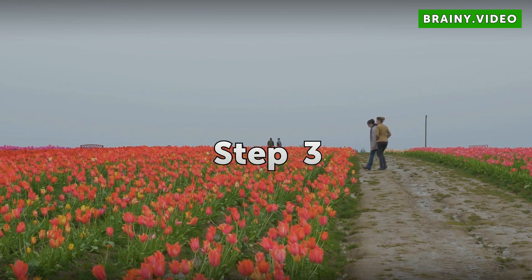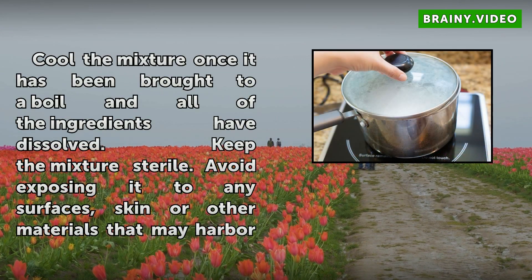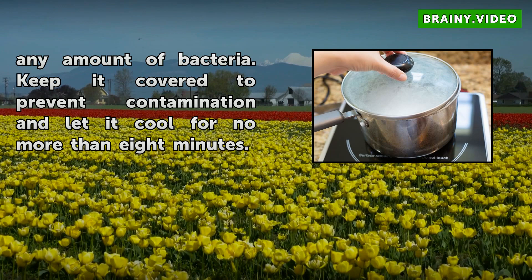Step 3. Cool the mixture once it has been brought to a boil and all of the ingredients have dissolved. Keep the mixture sterile. Avoid exposing it to any surfaces, skin, or other materials that may harbor any amount of bacteria. Keep it covered to prevent contamination and let it cool for no more than eight minutes.